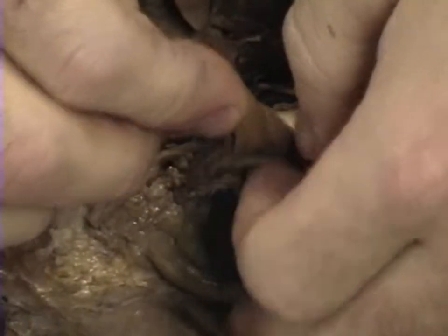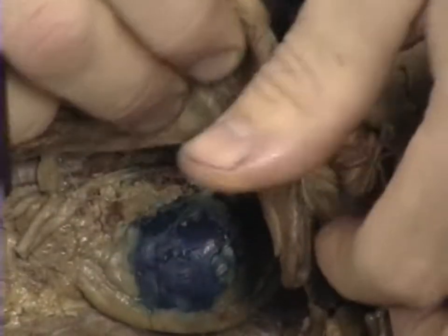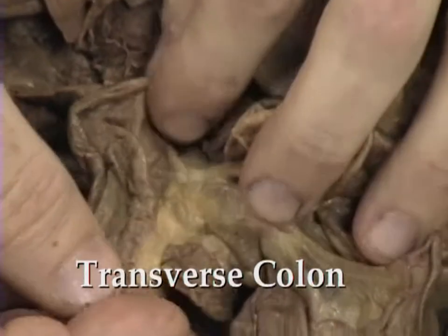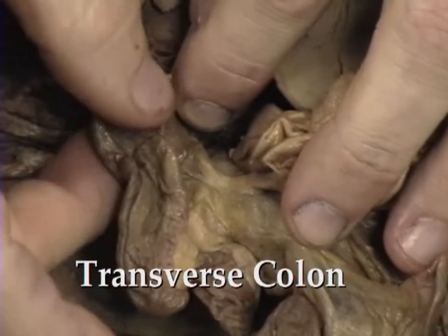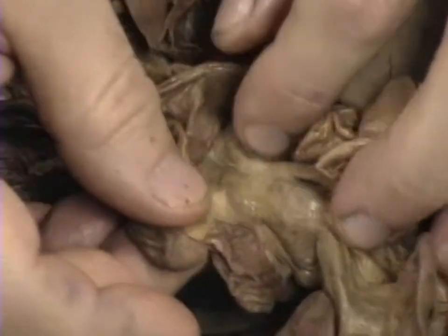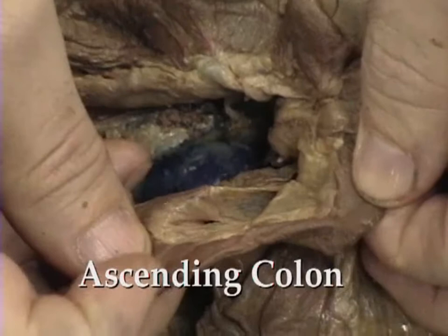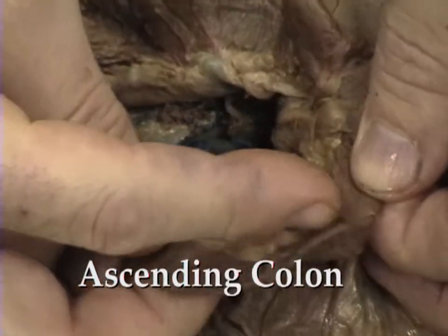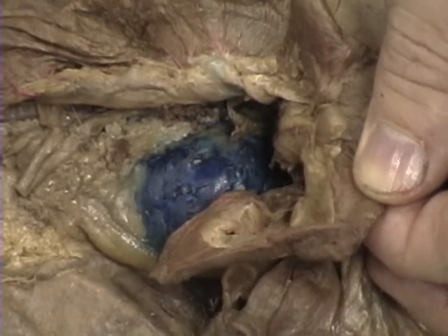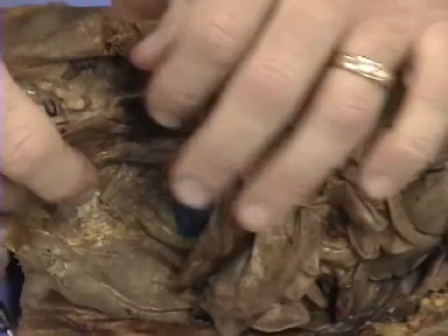The next portion, which will probably be hard for you to see, the next portion is called the transverse section. And the transverse colon is this portion here. So you have the descending, the transverse, and lastly the ascending, which is this portion here. So we have the ascending, the transverse, descending portions of the colon. Those are the three portions of the colon that we see here in the cat.